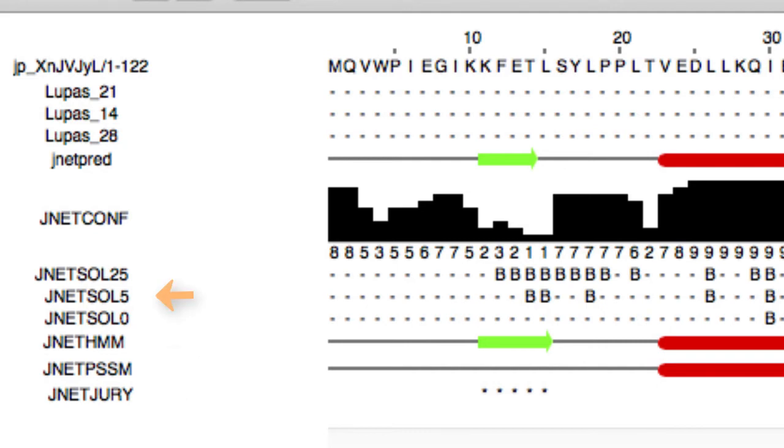Solvent accessibility prediction results are displayed in the JNET SOL rows. JNET SOL 25 highlights buried regions with less than 25% solvent accessibility.